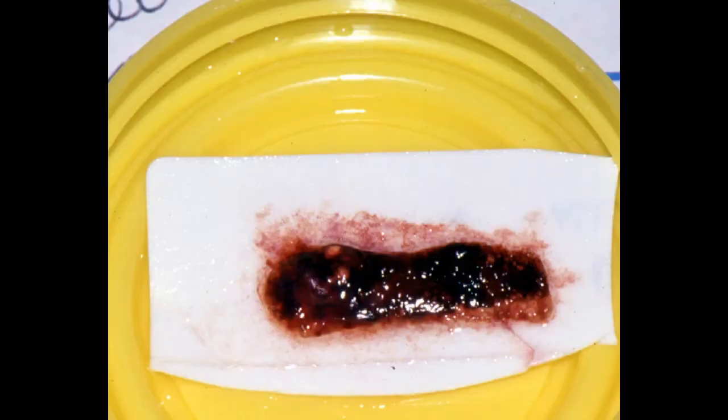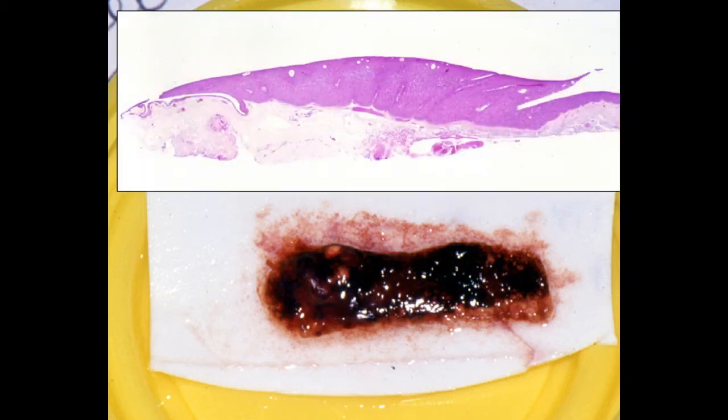Here's an example of a melanocytic lesion of the conjunctiva that was placed on cardboard and fixed as a sheet. The inset shows a squamous cell carcinoma of the conjunctiva that was fixed as a sheet. We can make the diagnosis and determine that one of the margins is involved.